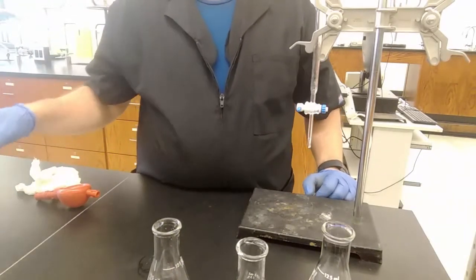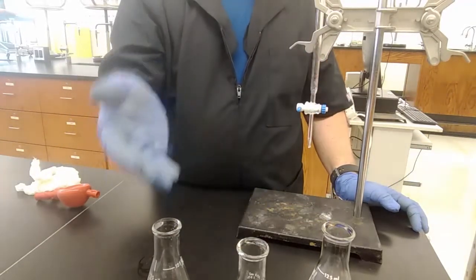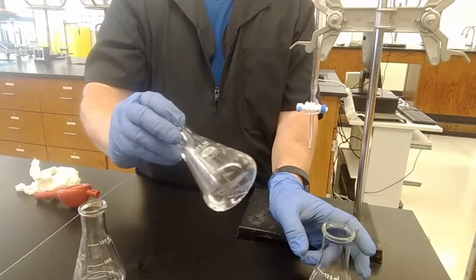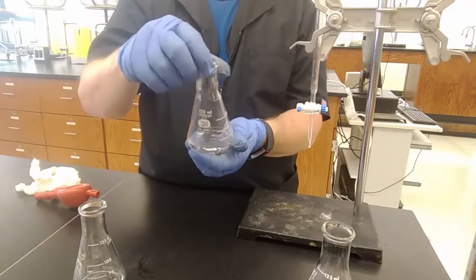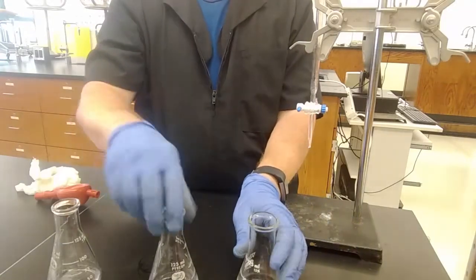Step three, we're recording 10 milliliters as our volume of acid used, because we did. We had 10 milliliters, 10 milliliters, 10 milliliters in each of these three flasks. So there's nothing different about the flasks, and that's why we didn't need to number them at all. Just getting a drop that was on the sides, wash it down in there, but we'll carefully do this anyway as we go along.